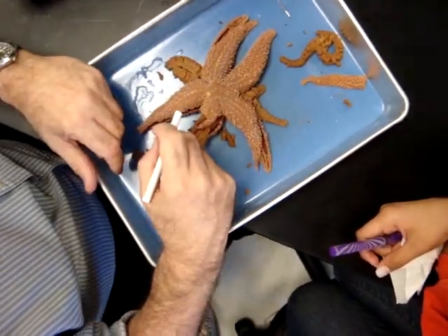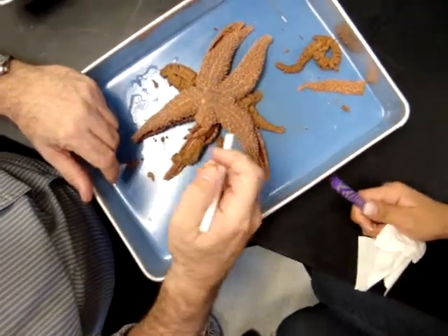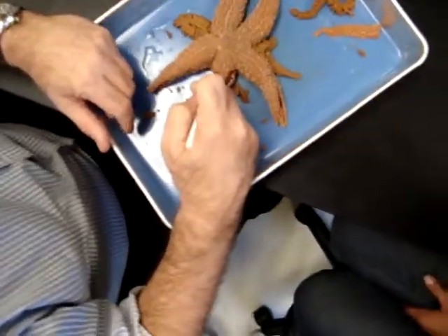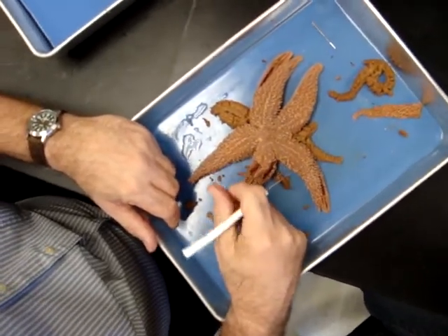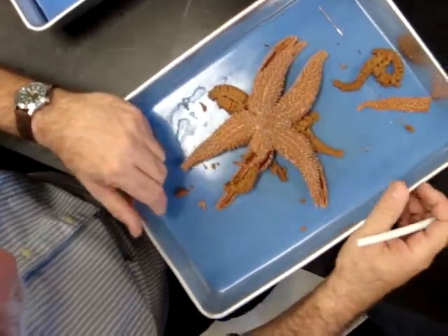I thought podia were tube feet. That's the same thing. I want you to know the synonym, podia or tube feet. This is called the madreporite or sieve plate. Okay, I could say, here are the tube feet, give me the technical name, podia. Okay, are we all right with that?